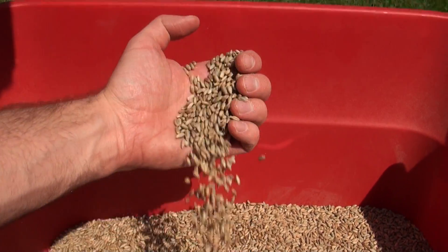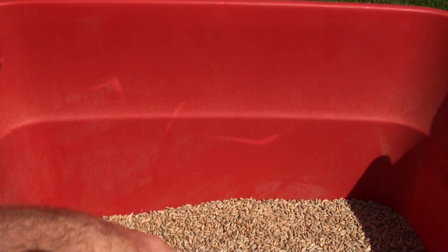Today we're going to be using rye grain to make the spawn. You could also use sorghum or millet — lots of different types of grains work really well. The best grain for you might just be what is most easily available in your area.